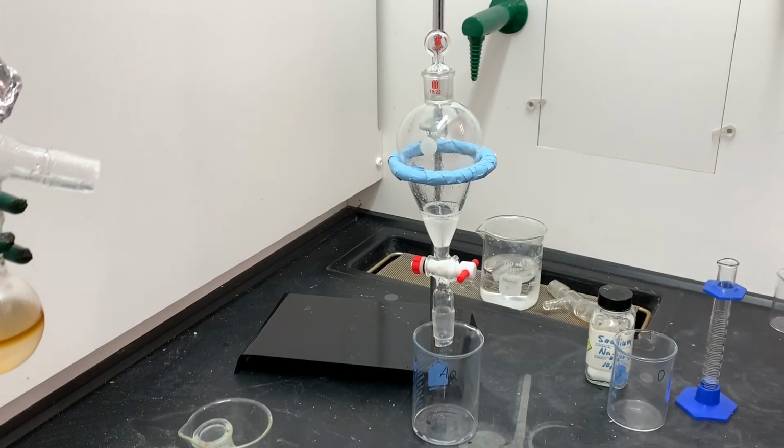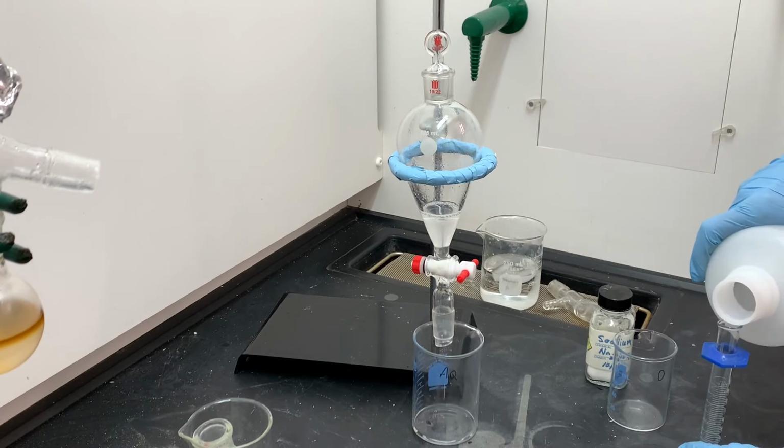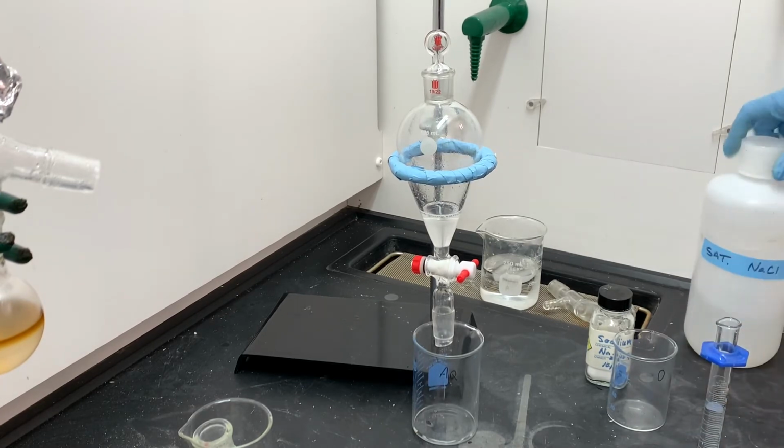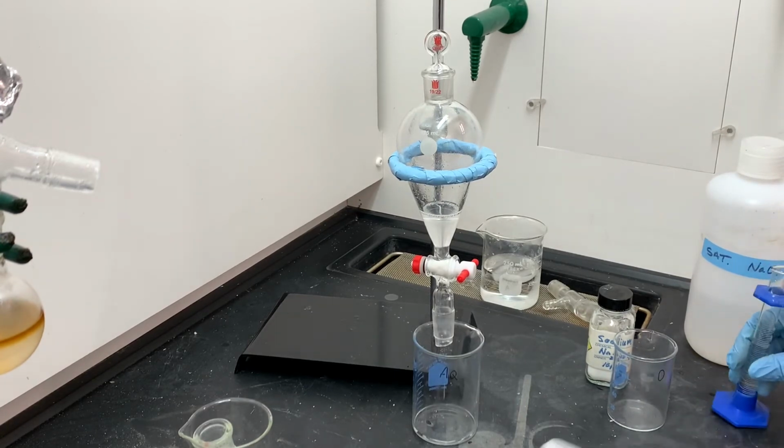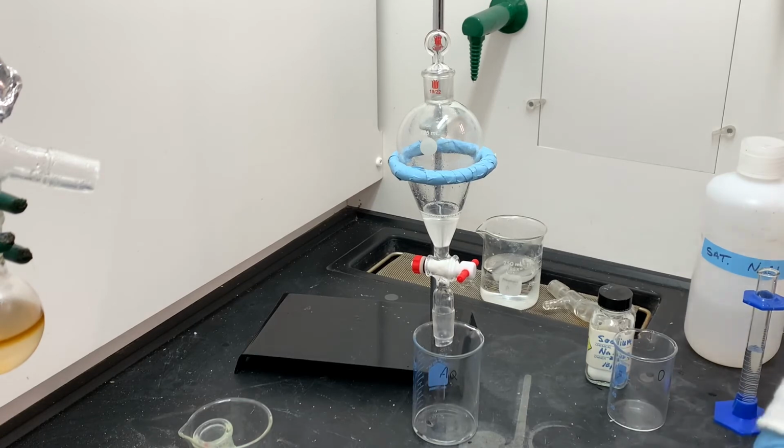Notice that it's hazy now. The top layer, which contains our product, is clear, so that means that it's purifying. It's getting nice and pure. Once these layers have had a chance to settle down and separate really well, I'm going to drain the bottom layer again. Remember, our product is on the top.